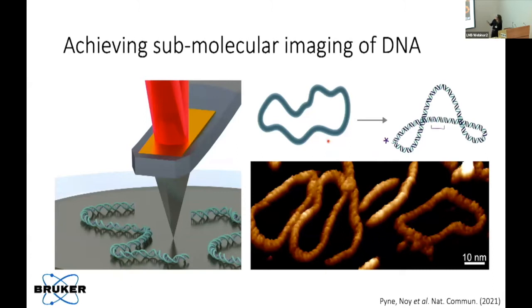Well, I talk about this as being the spaghetti to fusilli reaction, a change in resolution, where we suddenly go from seeing DNA as a worm-like chain with no features to being structurally relevant. But actually what this involved was 4 years of silicon microfabrication in the clean room, because it turns out that the rate limiting step here was the cantilevers that were being fabricated, which were designed to have end radii between 1 and 20 nanometers.